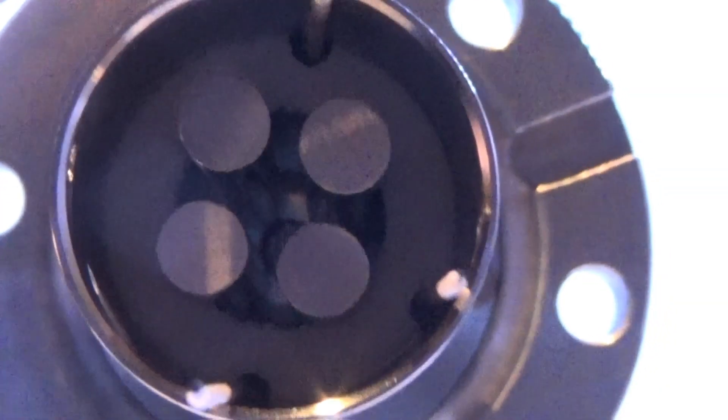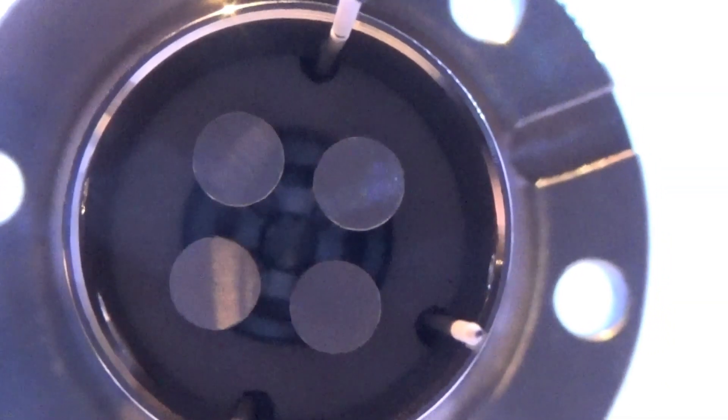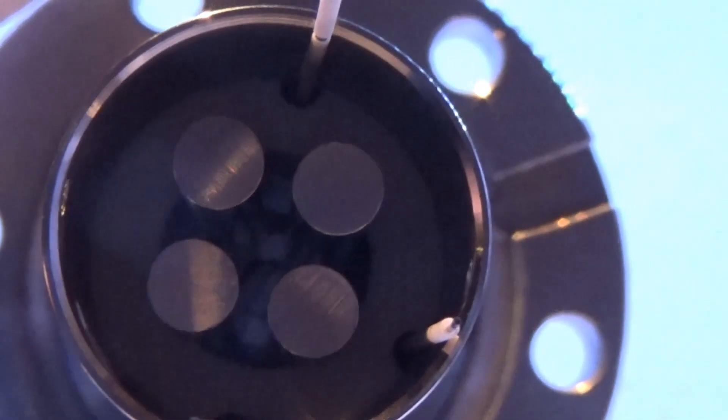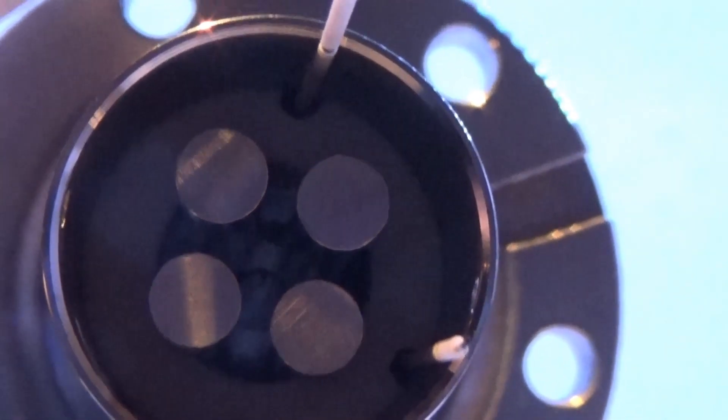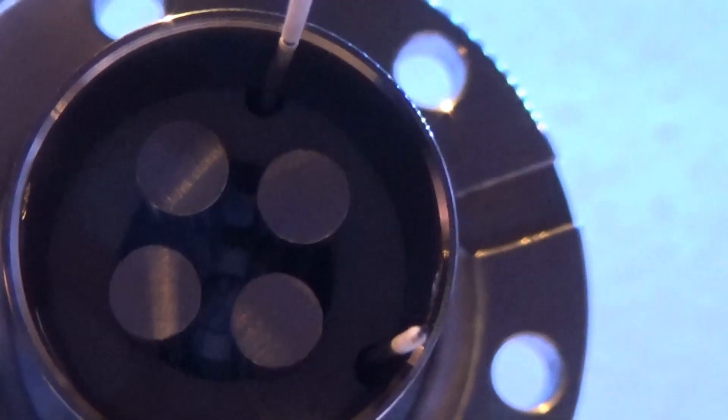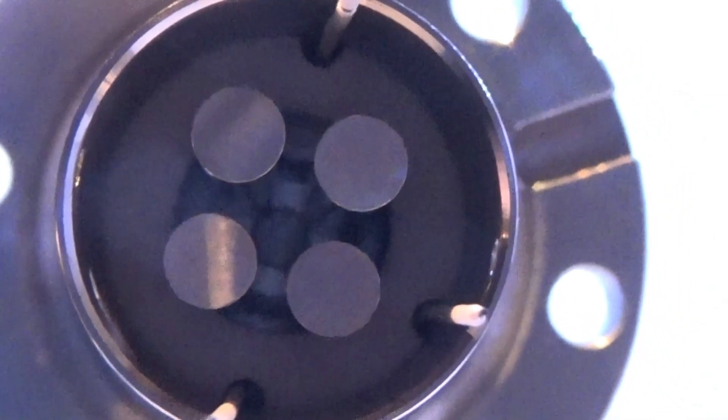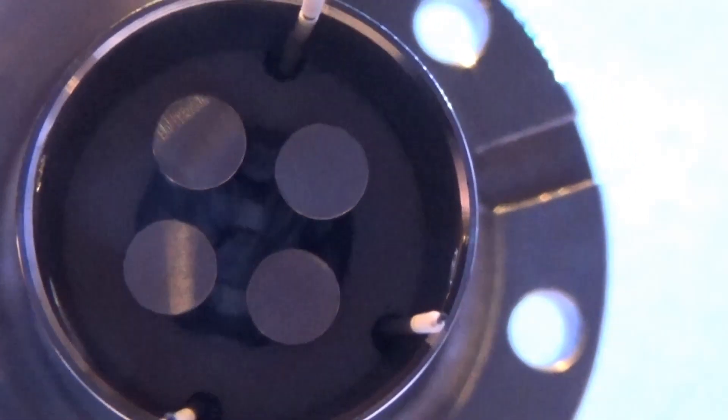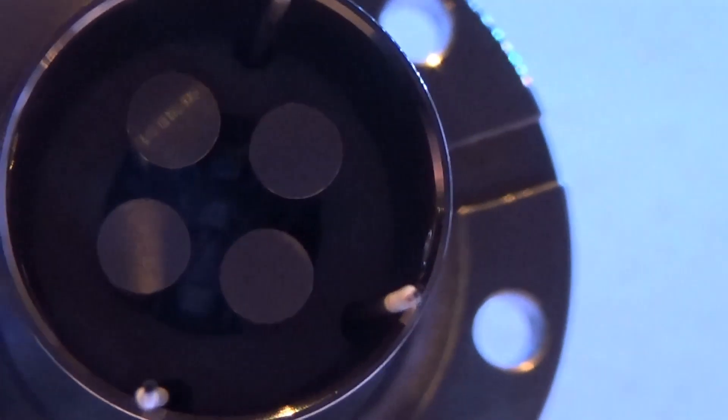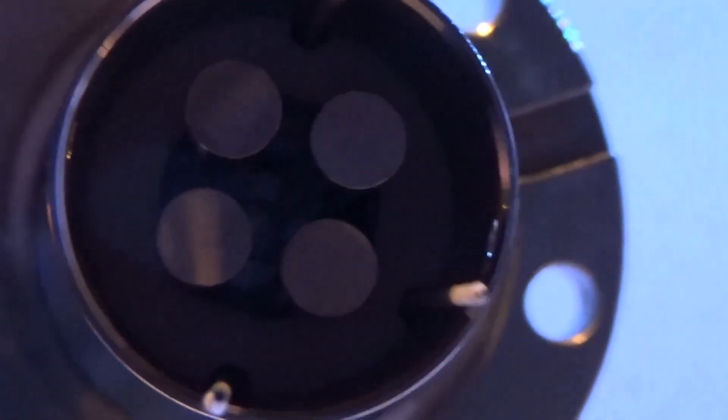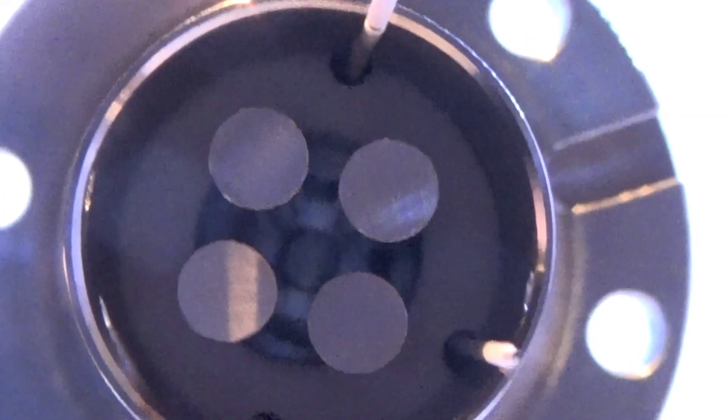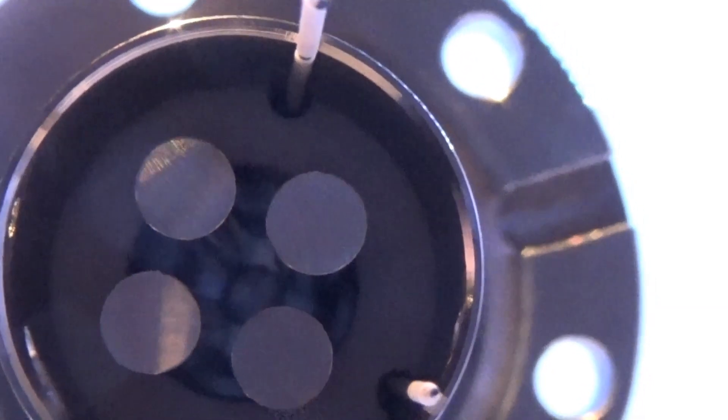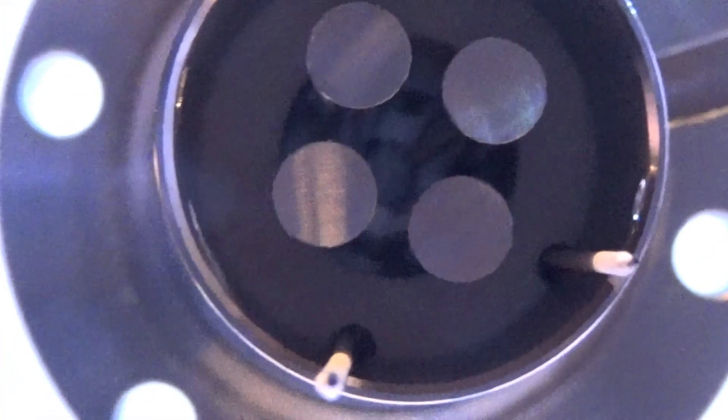But that's the quadrupole, and that's what actually separates the masses. These four rods are connected two and two in pairs across, so this one and this one is connected, and that one and that one is connected. And these are phased with a big RF transformer. They are phased to be 180 degrees apart, so they will be opposite voltage at opposite times. This generates a spiral pattern for the ions to follow, and for a given amplitude and frequency, only one mass to charge ratio of ion will be stable through this. Very light ions will simply just scoot off, and heavy ions will just not be course corrected enough to stay on track.